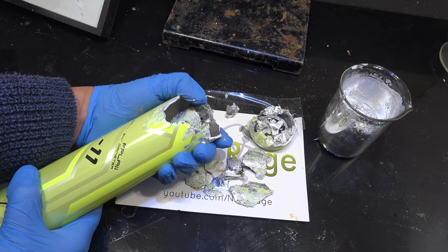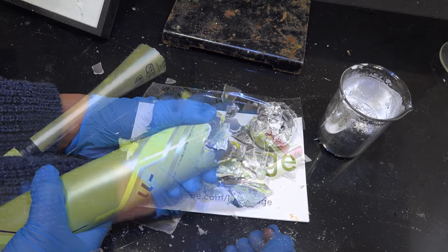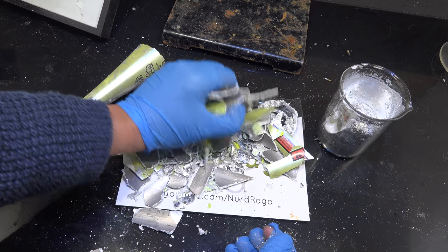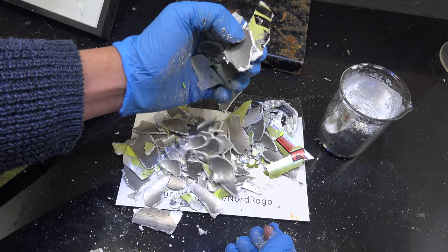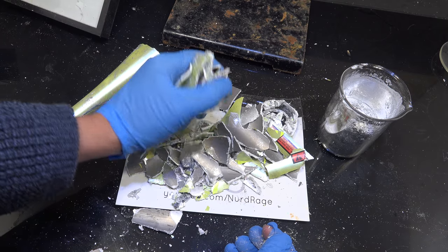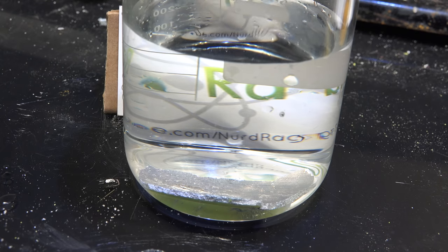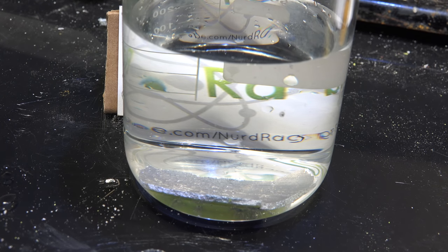Greetings fellow nerds. In previous videos you've seen me destroy aluminum objects with gallium. What's left over is weakened aluminum that has small amounts of gallium embedded in it. By your request, in this video we're going to try and recover some of that gallium. The most common suggestion was to react the alloy with water. This is not a bad idea, as gallium aluminum alloy is well known for being reactive with water. The problem with using the aluminum from our earlier experiments is that while they do have gallium in them, it's not enough.